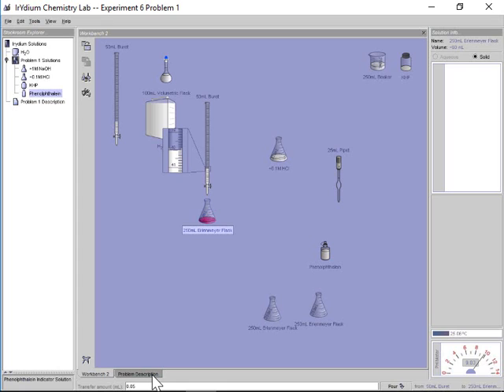In this case, I just take another volume reading here. The final volume reading was 40.02. Oh shoot, I forgot to take my starting reading here. You're out of luck. You actually need to do it again. But in this case, I had made 100 mils of solution. We poured in 40 to begin with. Let me actually demonstrate that. Oh shoot, I actually forgot to do my initial solution. Oh, let's try it again.